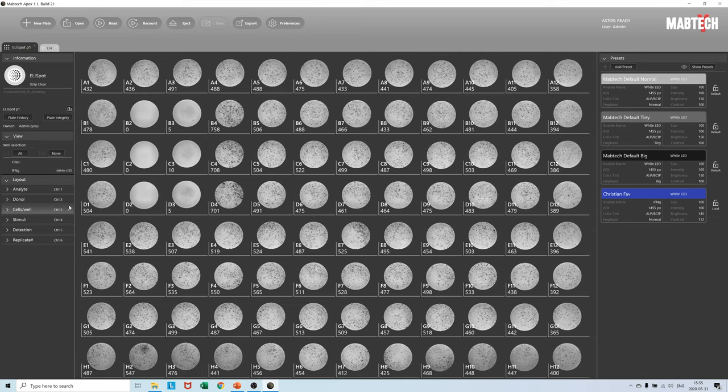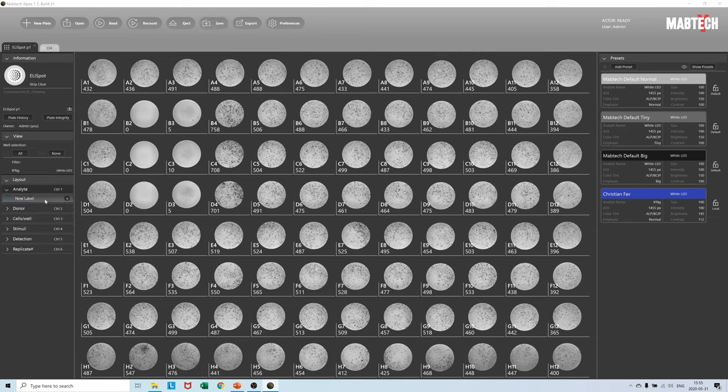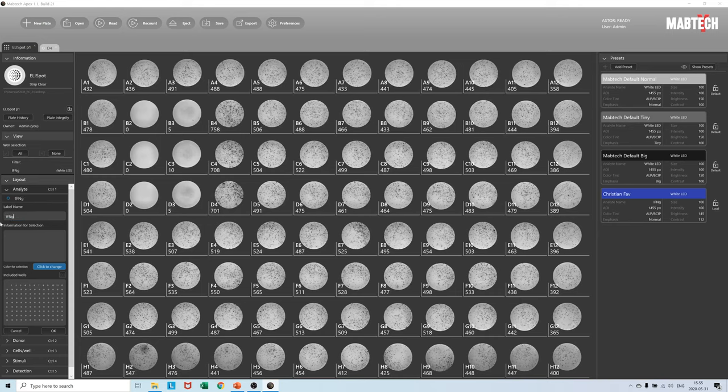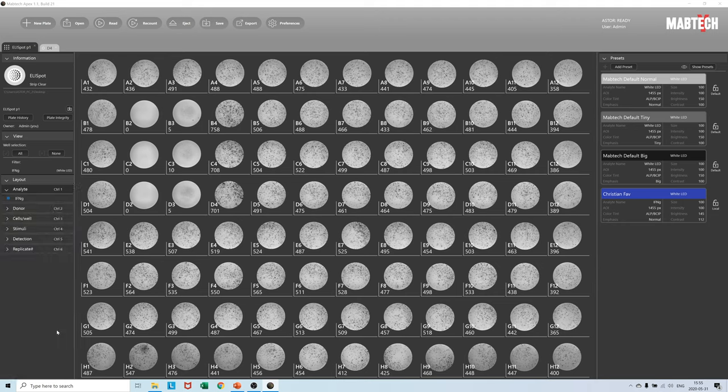Here we start by first adding a new label under Analyte, Interferon gamma. After naming the label let us use drag and drop so we select all 96 wells and then press OK.